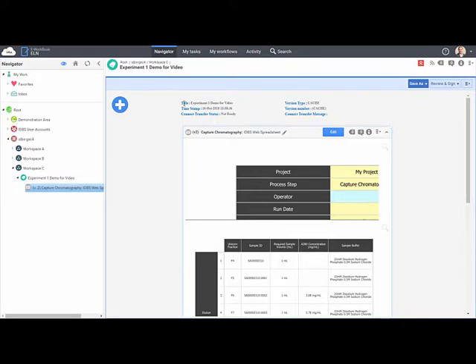And we can see that I've set this up to show the status of the transfer, which is not ready, and Connect transfer message as being blank at the moment because we haven't shared anything. And I've created this experiment in the workspace C in Connect.